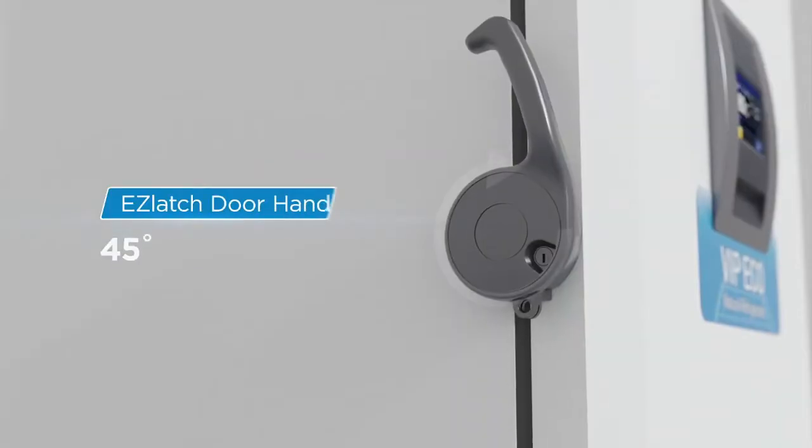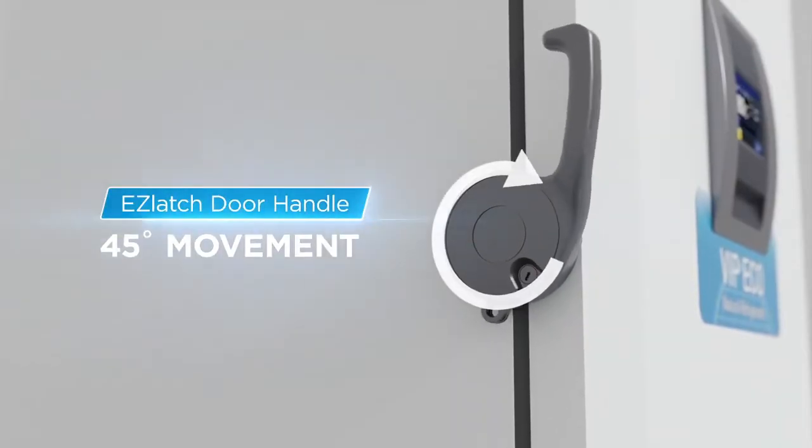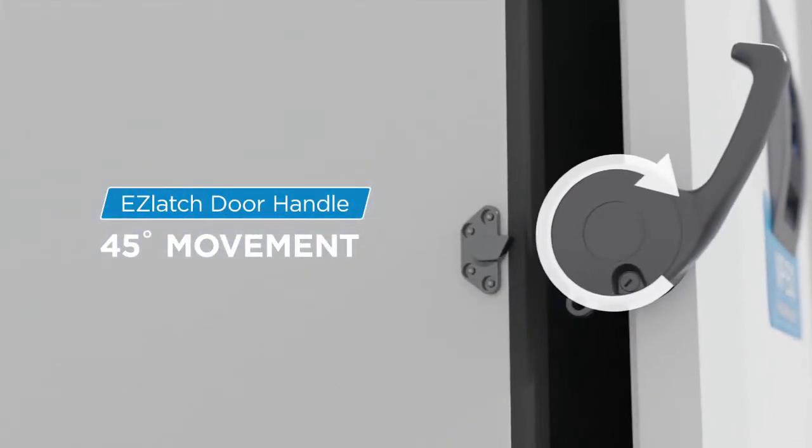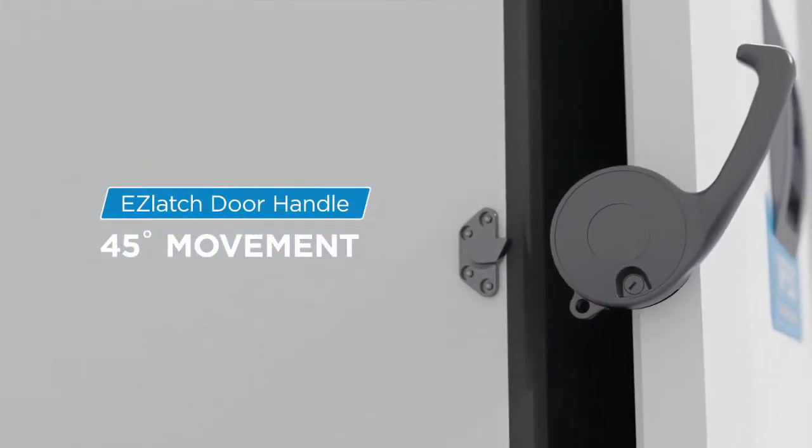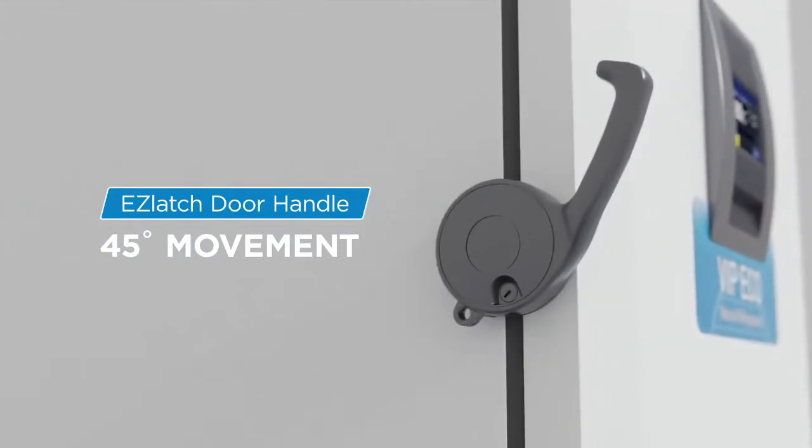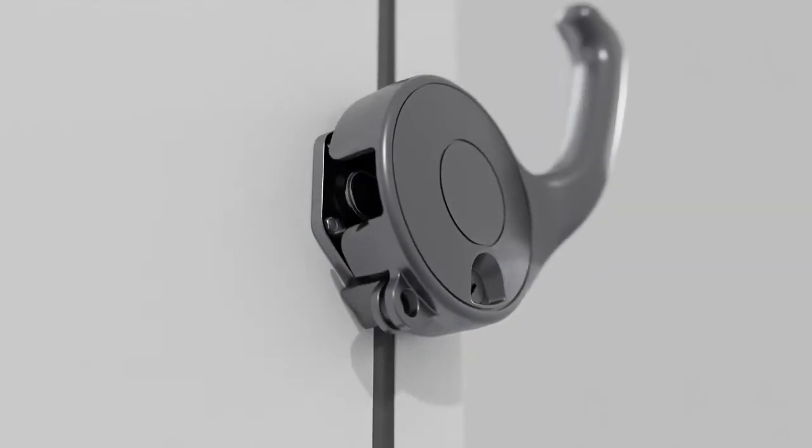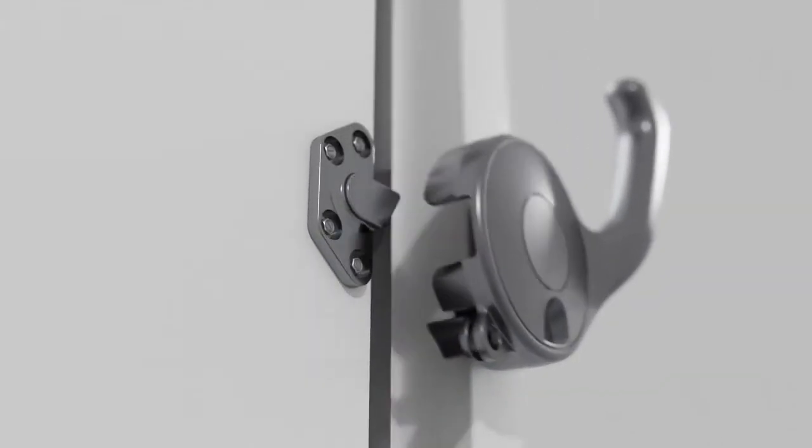The easy latch door handle is the result of decades of design and engineering. Its lasting durability ensures long-term dependable usage with easy one-handed operation.